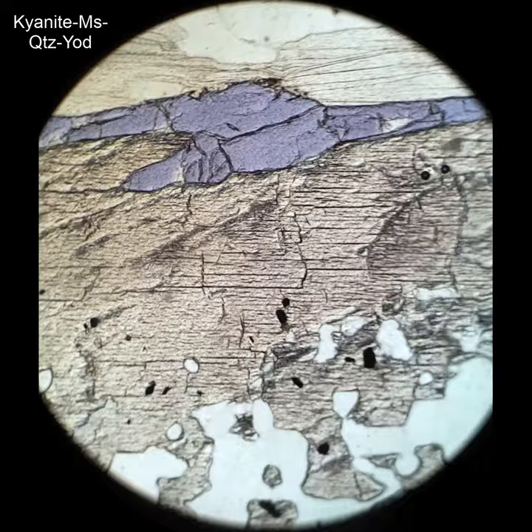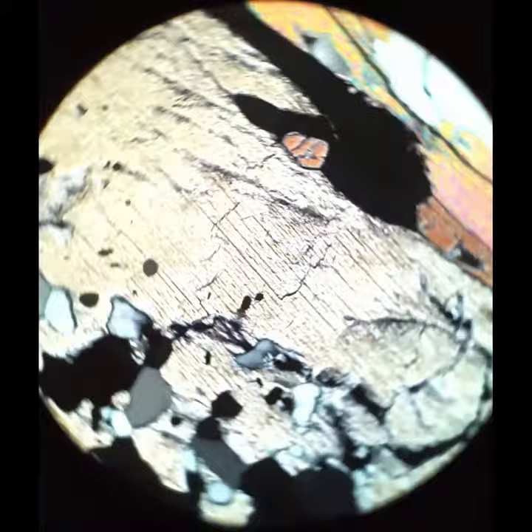The maximum here is orange. This is a rare kyanite from Tanzania. It's very faintly pleochroic yellow. The cleavage is parallel to the elongation of the crystal. It doesn't really have strong parting and low interference colors here. The vivid blue mineral on the outside is called yoderite, another rare mineral.